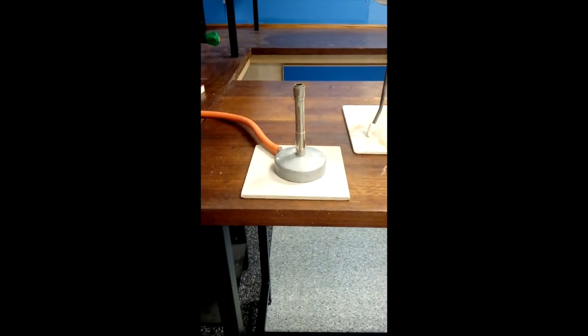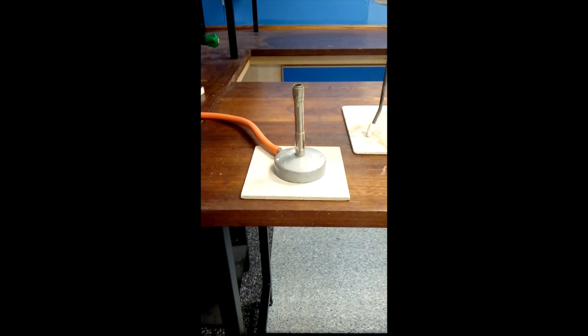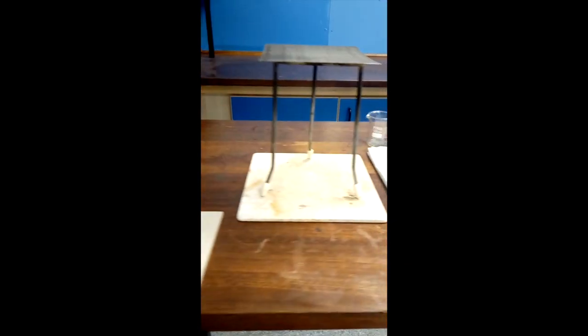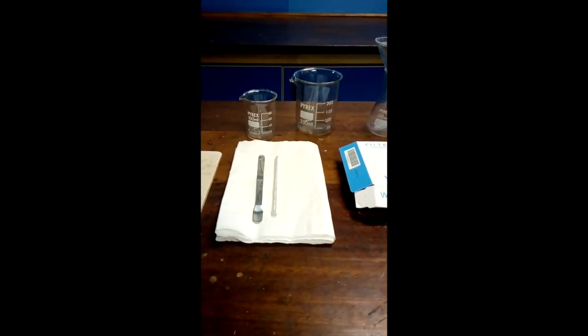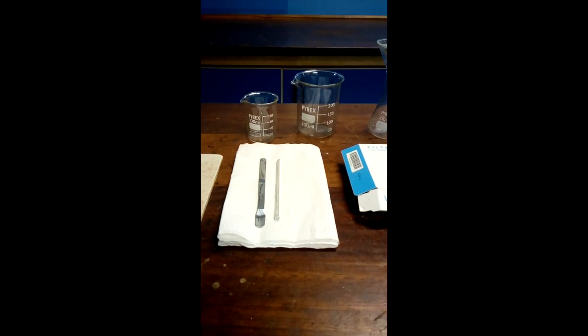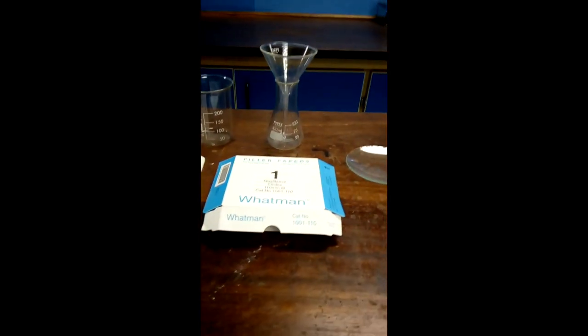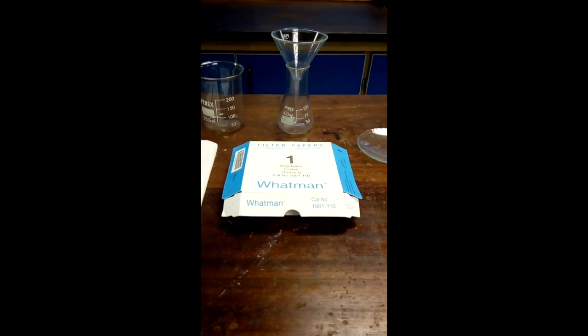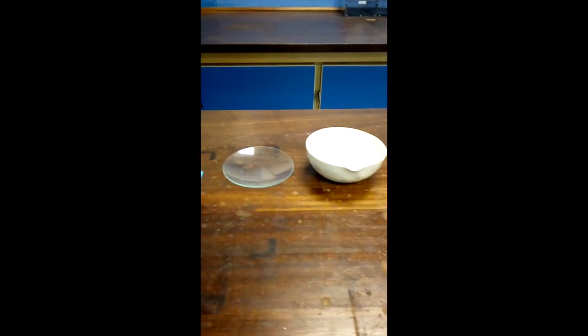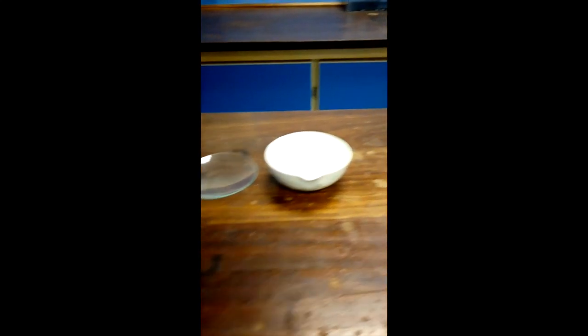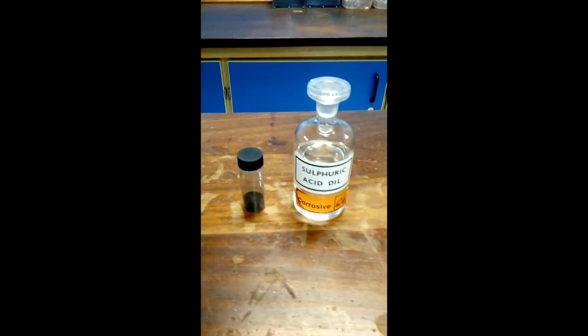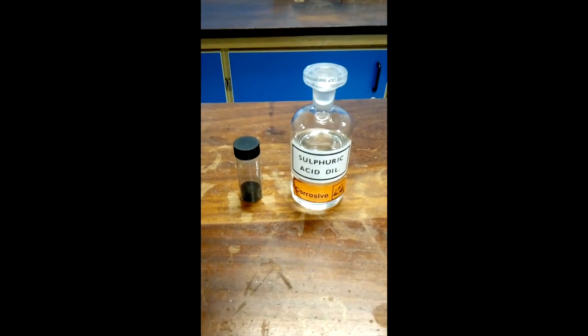You are provided with the following: Bunsen burner, heatproof mat, tripod and gauze, spatula, glass rod, 100 and 250 cm cubed beakers, filter funnel and conical flask, filter paper, watch glass and evaporating basin, and your initial reagents of copper oxide powder and sulphuric acid.